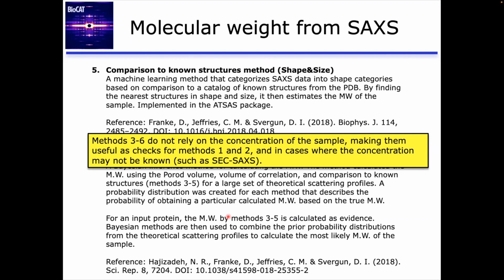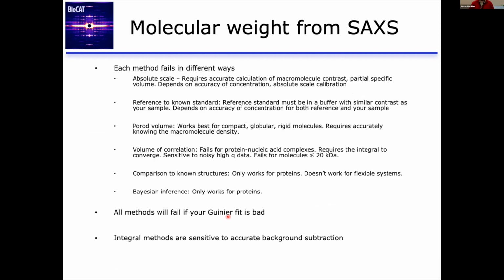So this is a question in chat that's probably worth having a discussion. Are you expected to get approximately the same molecular weight using these different methods? So that leads into my next slide, actually, honestly. So the answer is no, not necessarily. Each of the methods fails in different ways.